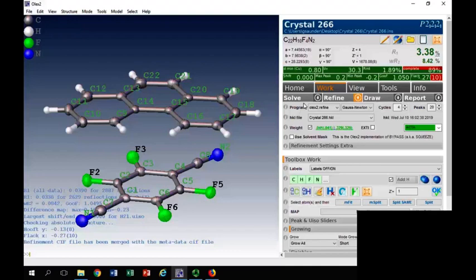If you put in selenium, it actually gives you a better result than if you had bromide. It gives you a better result crystallographically, but chemically it's nonsense. You've got a cation on its own with a neutral atom. That doesn't make sense. So use your chemical knowledge, go with that. It's a salt, there must be an anion for every cation.